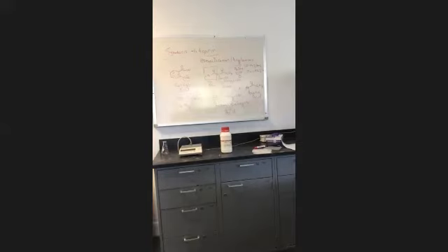So your salicylic acid should have the molecular weight of 138. And then your acetic. Then we're supposed to look at the molecular weight for the salicylic acid and the melting point. All right, but you just write it under the, oh, right here.